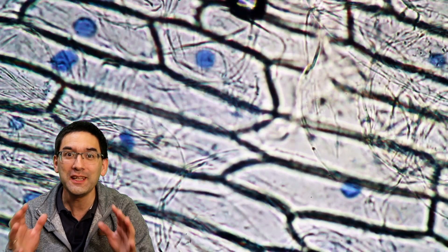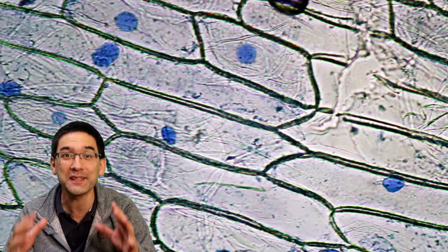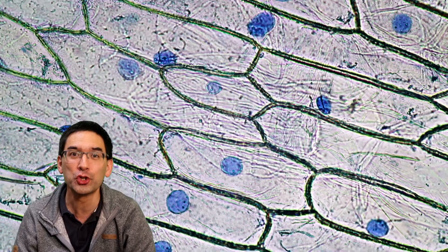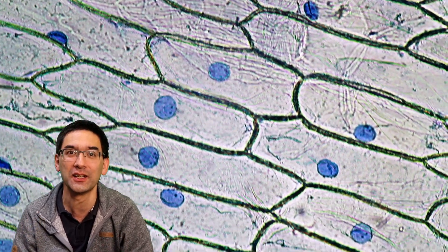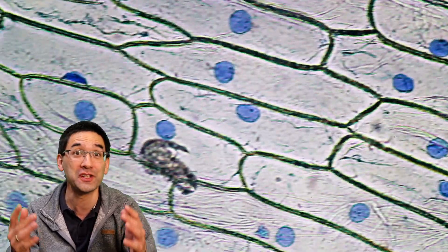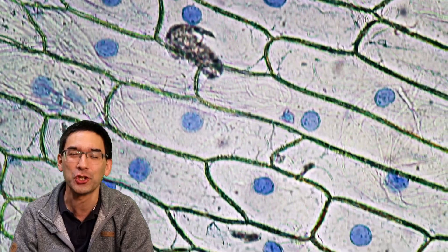Hi, Micropunter here again. These are onion cells and each onion cell, if you look carefully, has a bluely stained nucleus. In this video I'm going to show you how you can stain the cells of an onion yourself so that you're also able to see those nuclei, because it's a very straightforward and simple staining procedure.